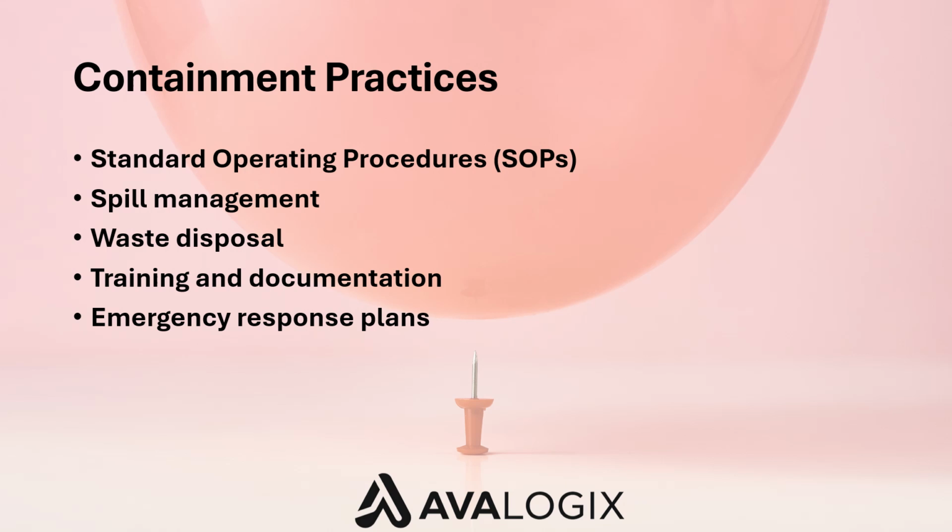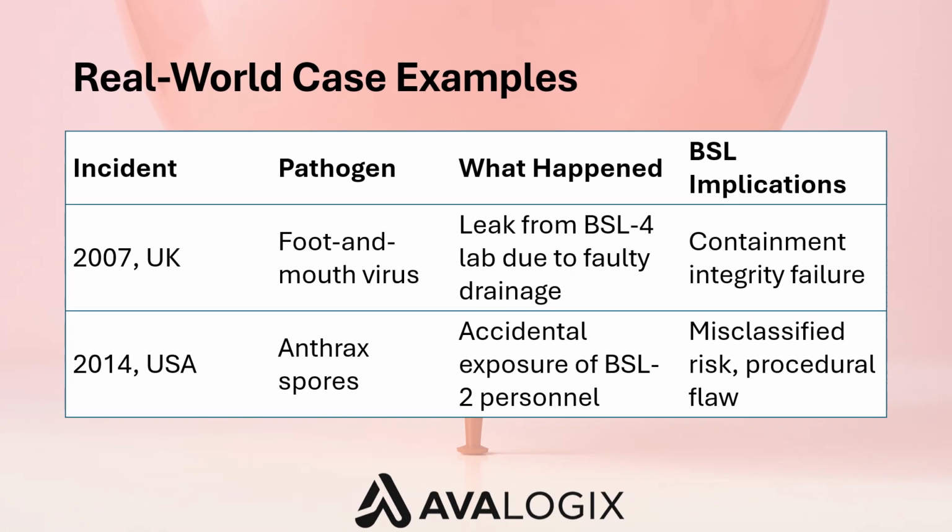The idea is to create a culture of safety where everyone feels responsible not only for their own safety, but for the safety of their colleagues, the environment, and the public. Let's look at a couple of real-world incidents that highlight why biosafety matters so much.